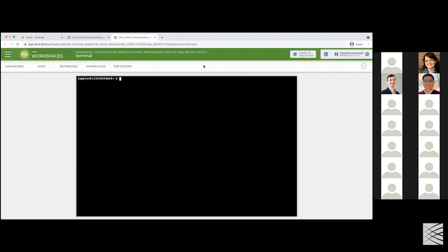And just for the briefest and most simple demonstration, I'm just going to list the files. And I say, oh, there's a notebooks directory. And if I go into that notebooks directory and list the files, oh yeah, so here's some of the files in my notebooks directory that look familiar. Like, oh yeah, there's the name of the workspace and things like that. So you can continue to work in here and move files around, see what's there. Very, very useful and powerful for that.